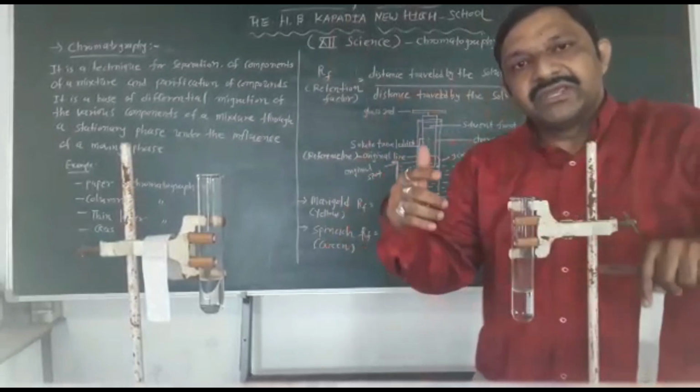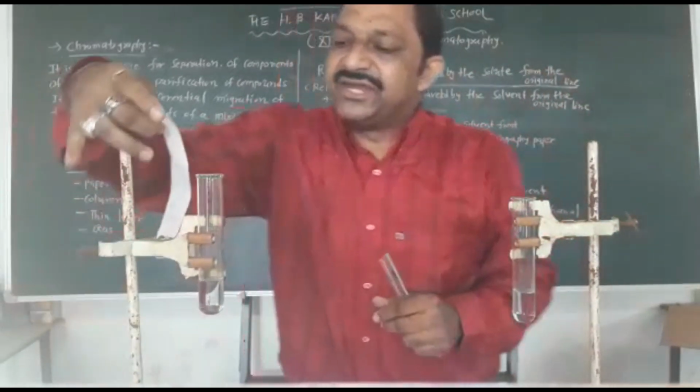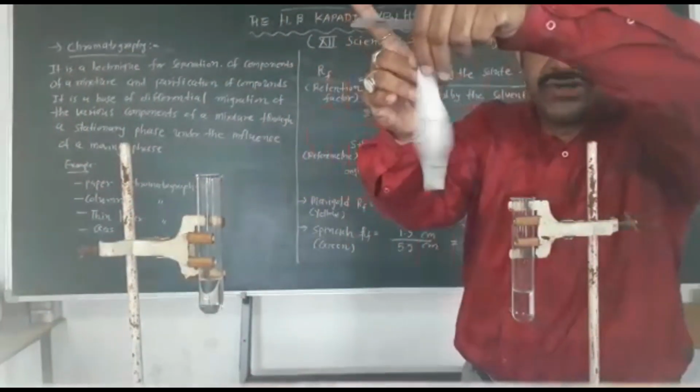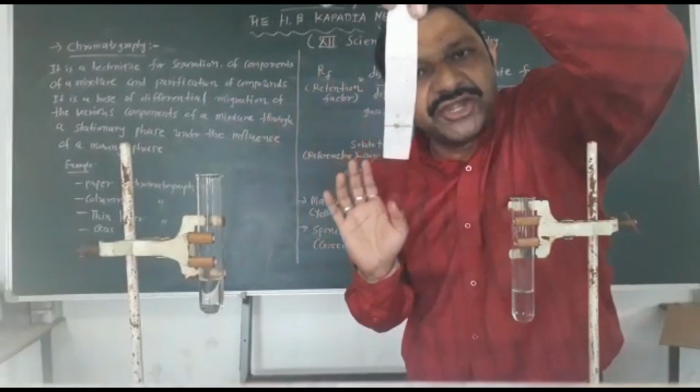Now in the second one, here is your spinach, the green dot.